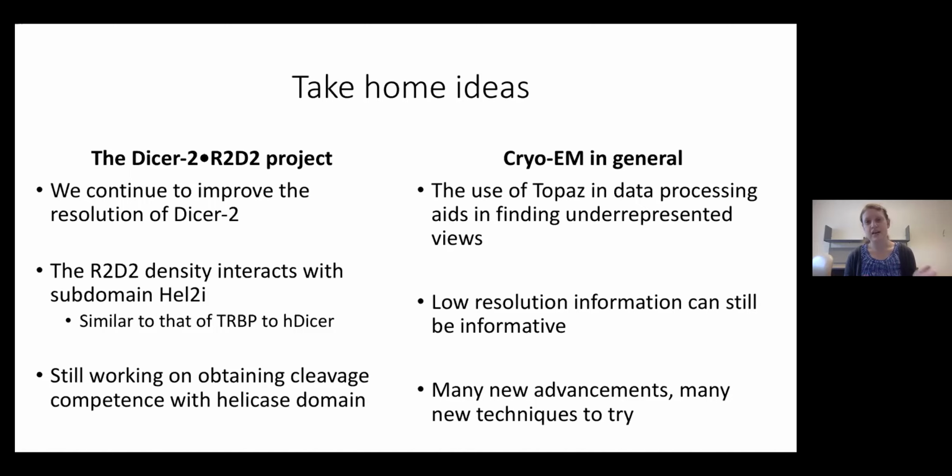I think at this time, Topaz is a bit underutilized, but I've encouraged my colleagues at the University of Utah and specifically the members in my lab to try Topaz, and many have been successful. So I highly encourage anyone on this talk that's processing their data set and thinking, man, I really wish I had more views of this one side of my protein, Topaz might be able to help you out.